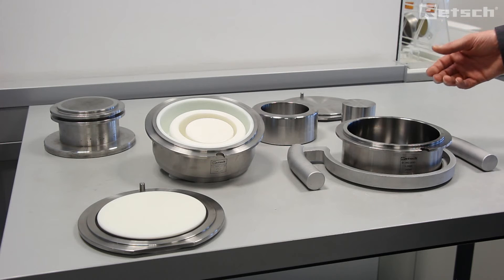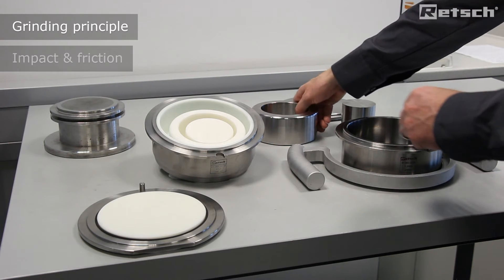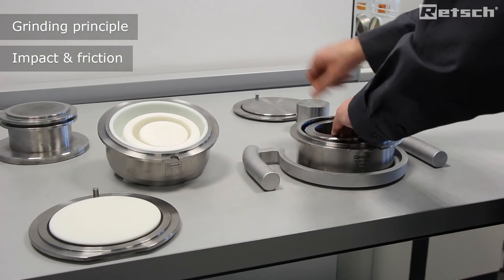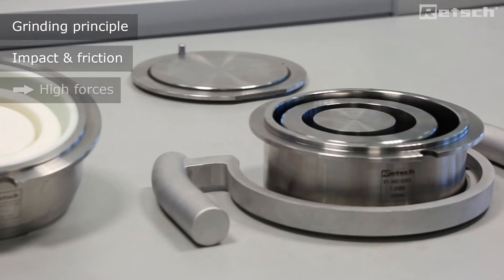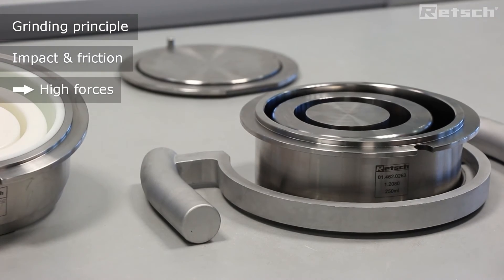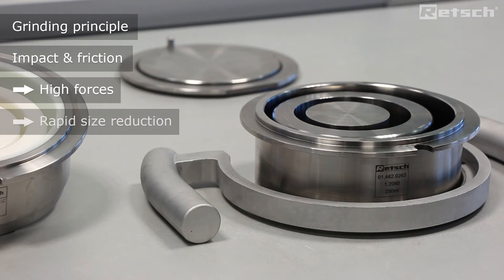High pulverization forces are generated by the use of a ring and puck, which generate very high forces through eccentric movement due to their mass. This leads to rapid grinding of materials in just a few short seconds.